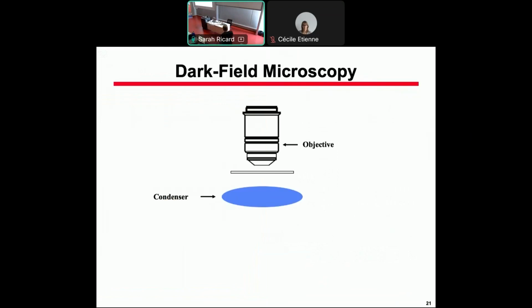So, very rapidly, in fact, there's no real paper inventing this. Many people use it. If the problem is the light coming from the source, just try to suppress the light coming from the source. And this gave birth to the so-called dark field microscope.